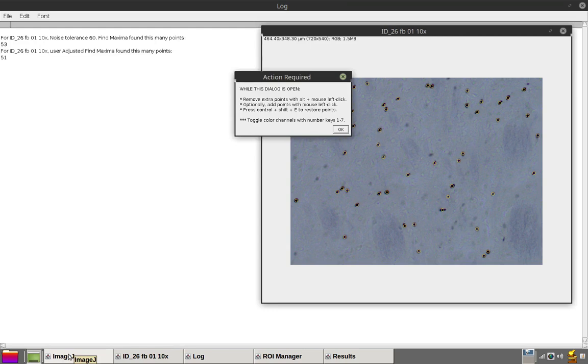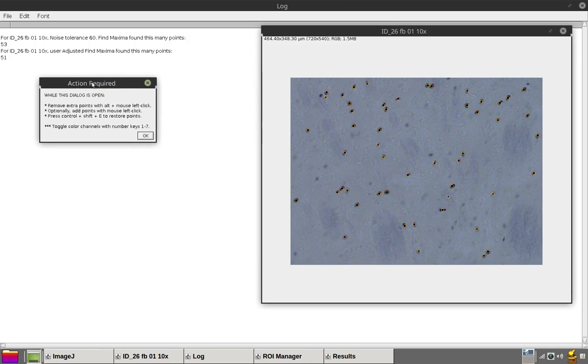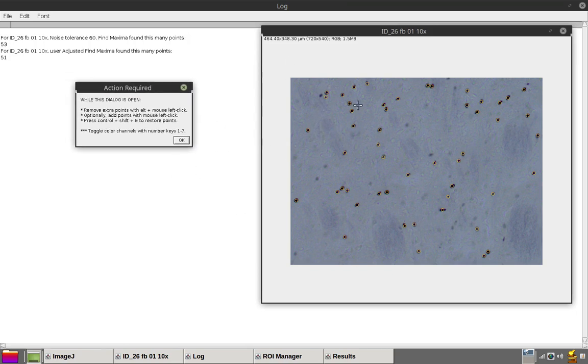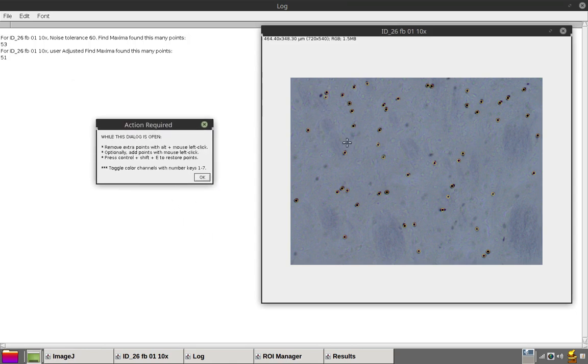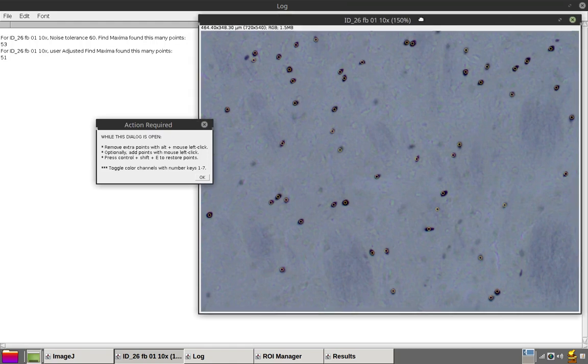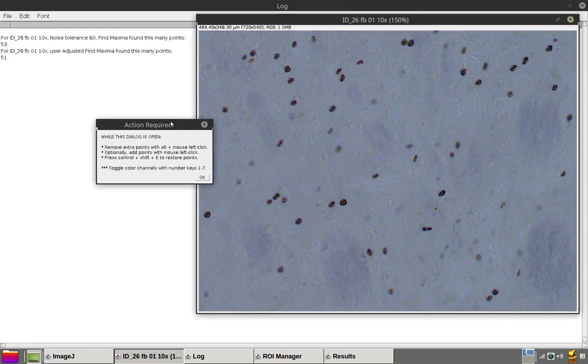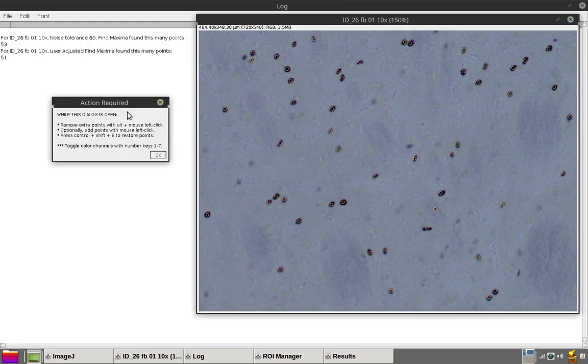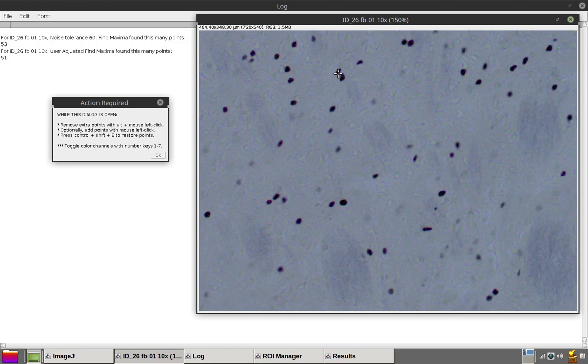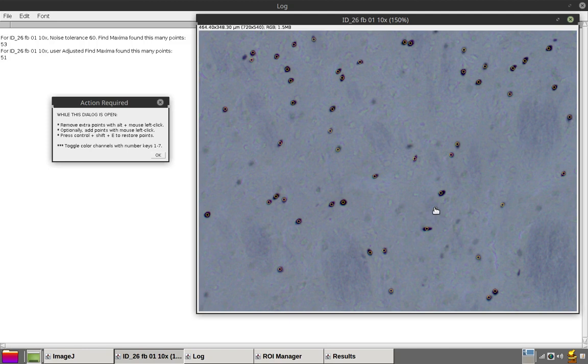Follow the instructions and the prompts and follow along as I remove and add points. One way to see what's underneath these point markers is to actually select none or select or restore selection by pressing ctrl shift A or ctrl shift E. But it's also fine to just move these points around.